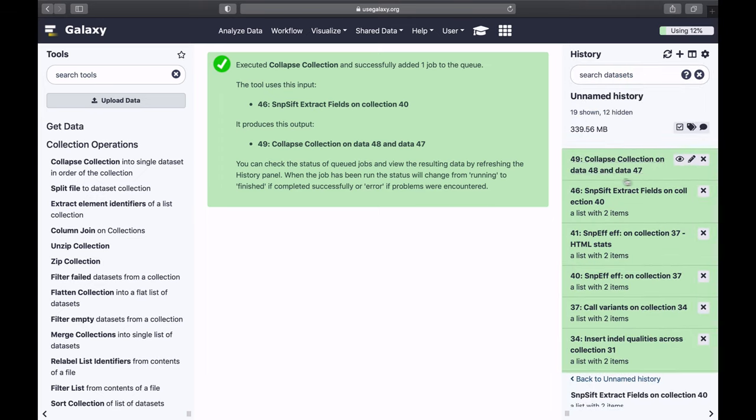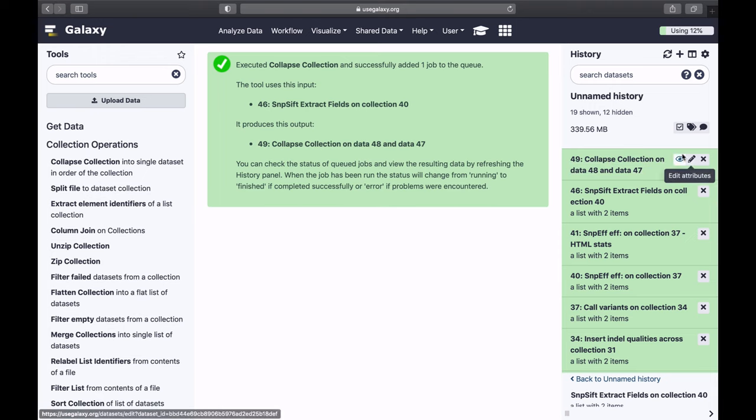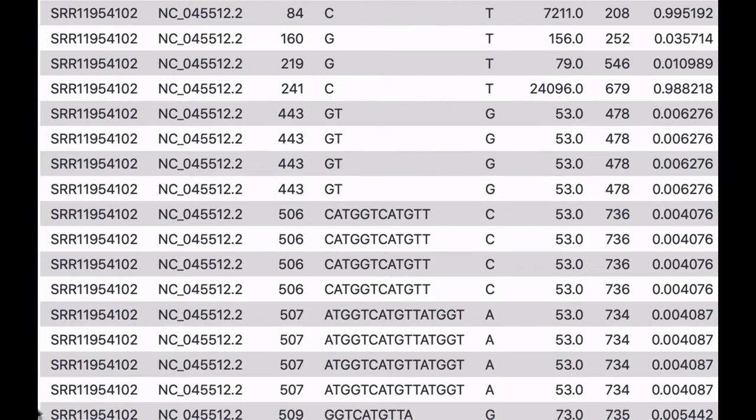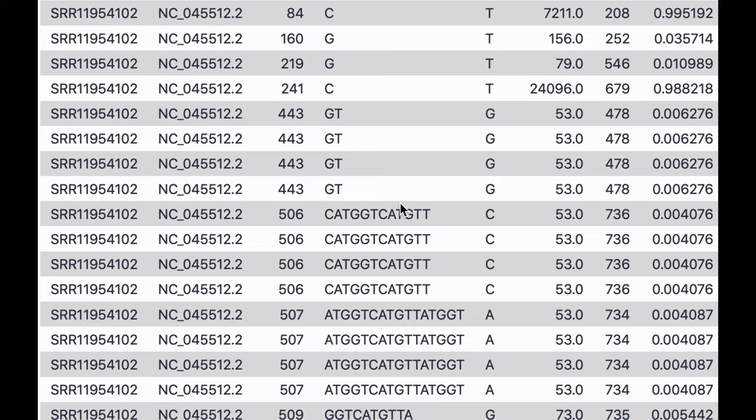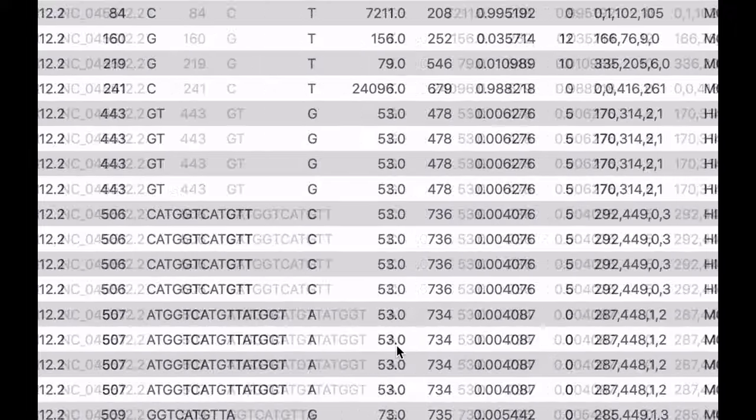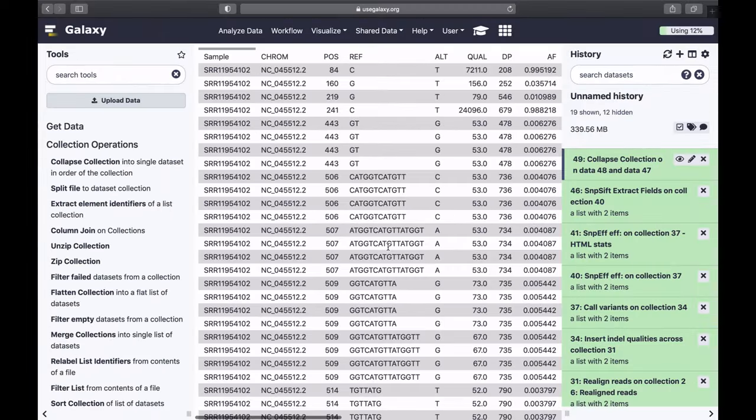So now, it's no longer a collection, it's just one data set. If we click on the eye icon, you will see that there's a new first column, and that column indicates from which data set these data comes. Of course, in this case here we only have two data sets, but you can imagine how this would work exactly the same way with 1,000 or 10,000 data sets. And so, this is the table we can work with. That's the list of variants that we would be interested in.